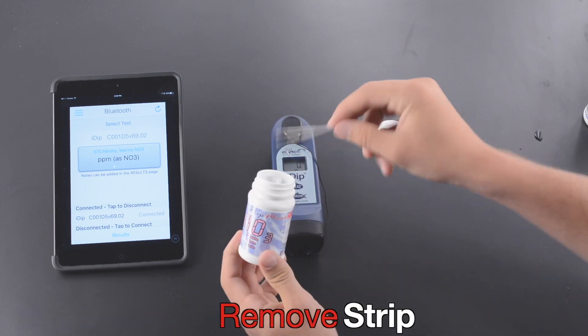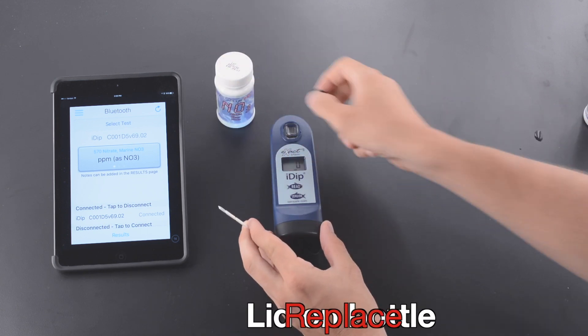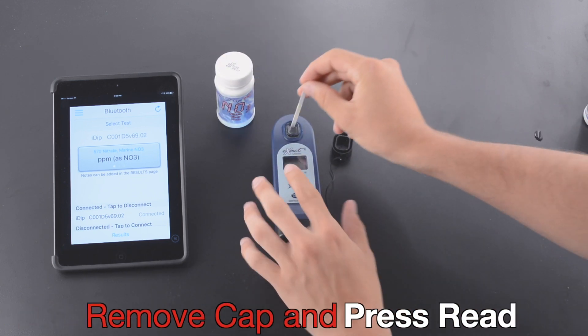Remove Strip. Replace Lid on Bottle. Remove Cap and press Read.